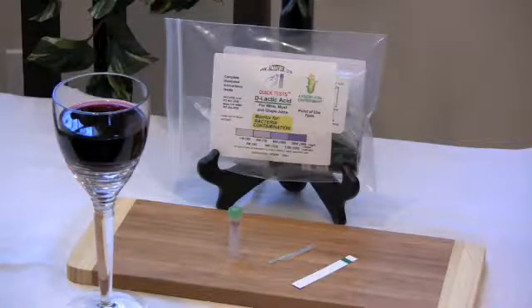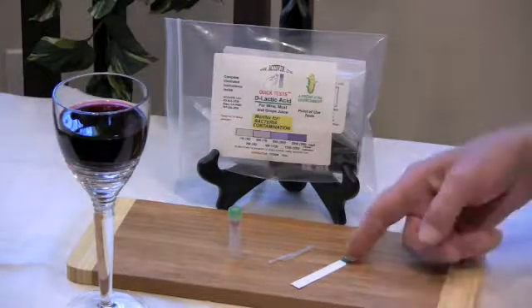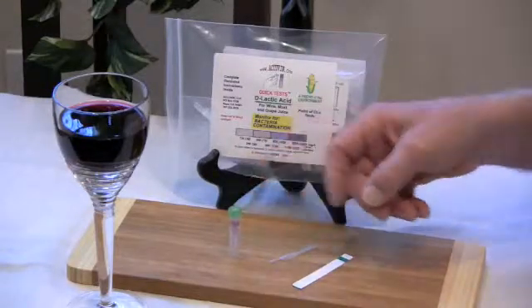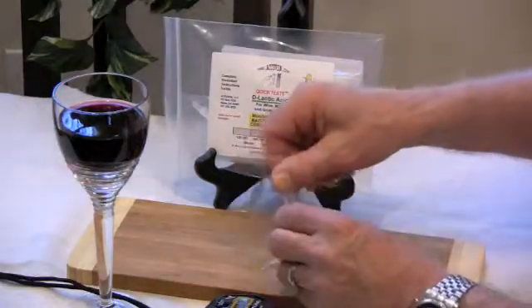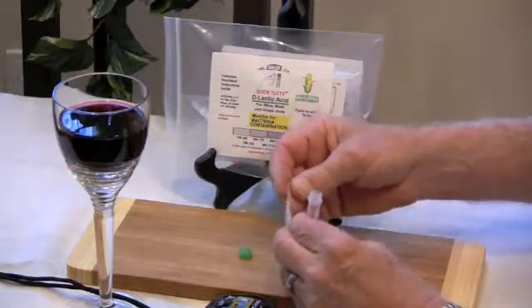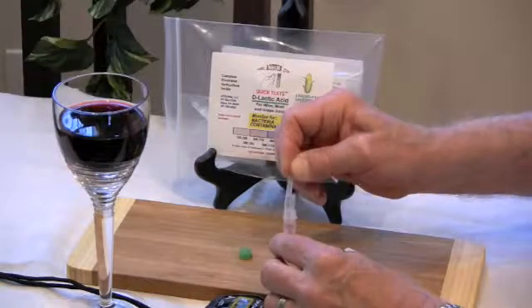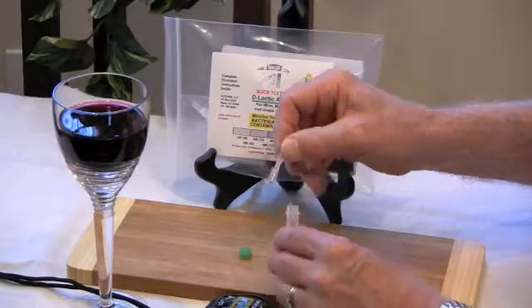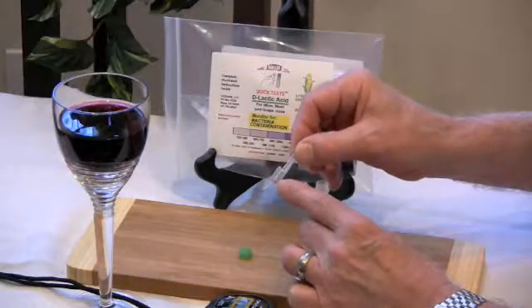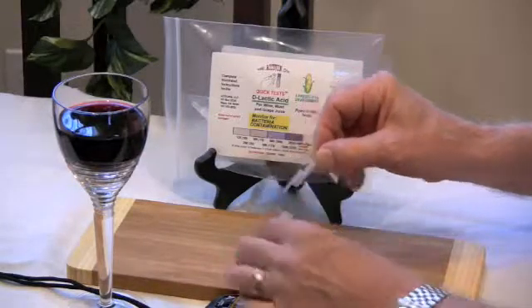To run step 2 of the D-lactic acid test, you'll need a test strip, a small sampler, and a diluted sample. Remove the cap from the green tube. Squeeze the sampler by the top bulb, place the tip into the wine sample, and release. The sample is contained in the straight portion, and excess sample is contained in the overflow bulb.